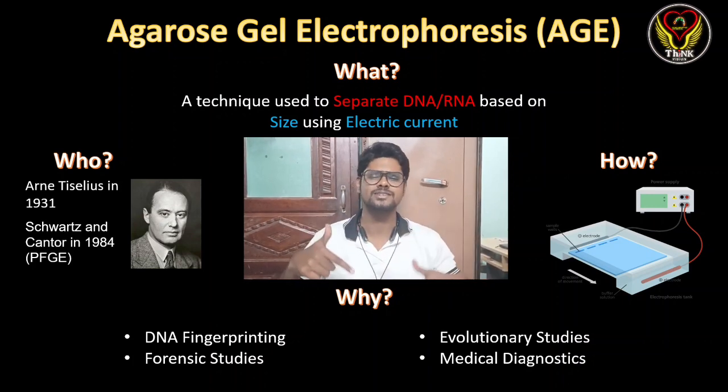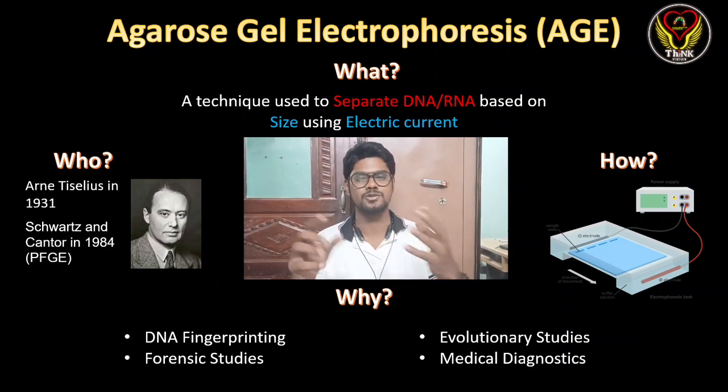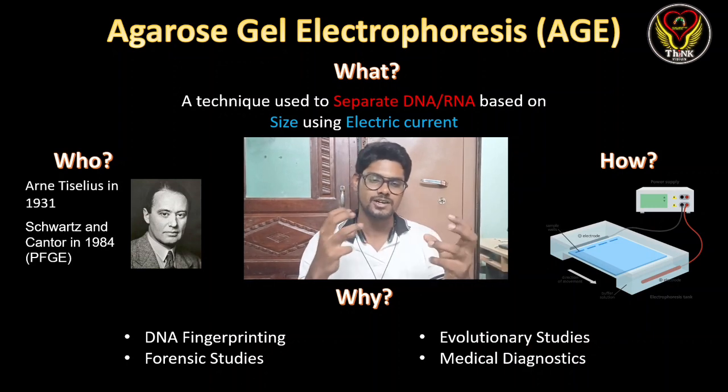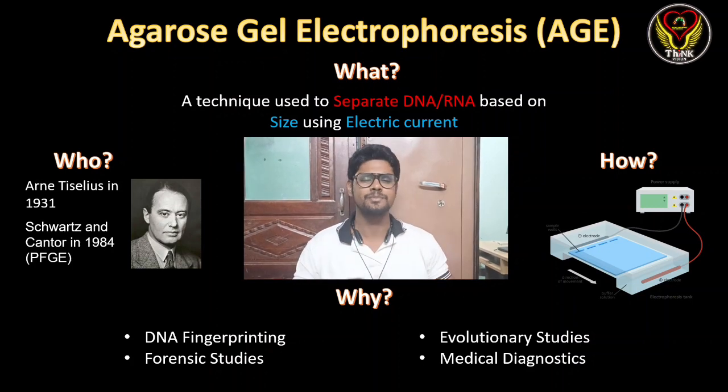There are many applications for AGE. Some to mention are DNA fingerprinting, forensic studies, evolutionary studies like how animals are related to each other, and lastly, medical diagnosis. Now let's check the principle and procedure of this technique.